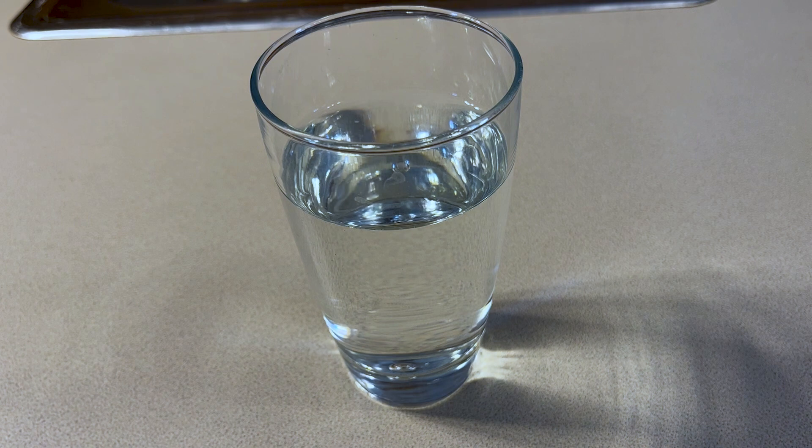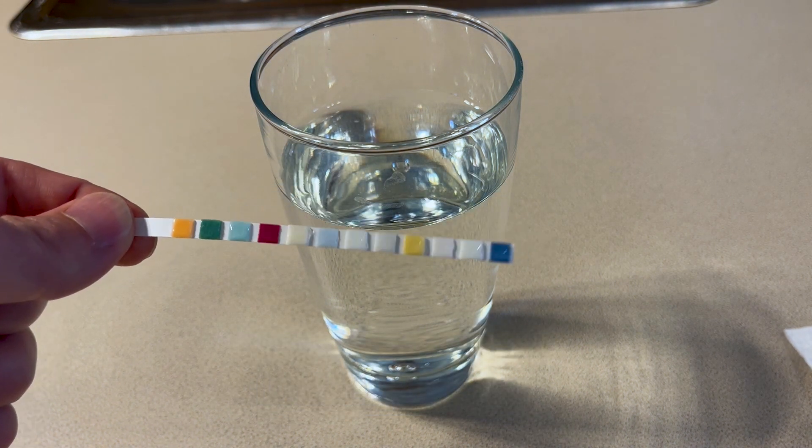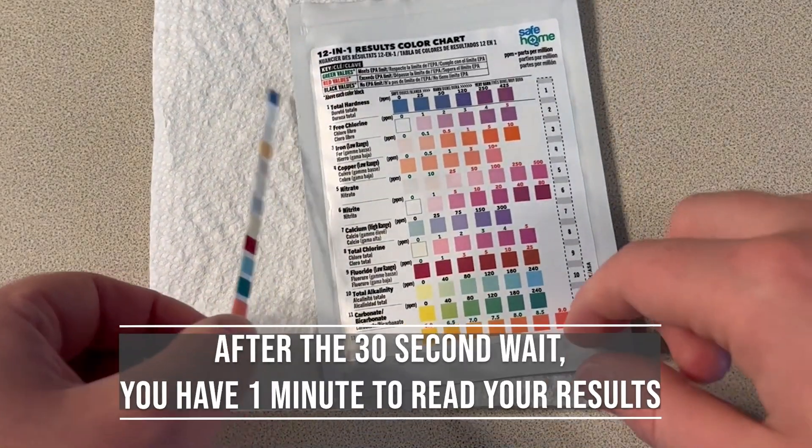Gently shake off any excess and lay it on a flat surface with pads facing upwards, and wait 30 seconds. This 30 seconds gives the colors a chance to develop.